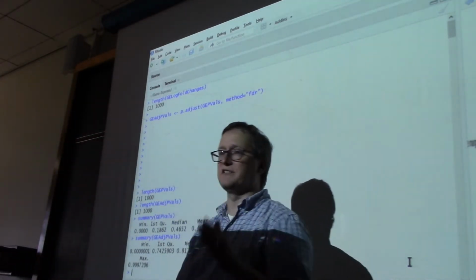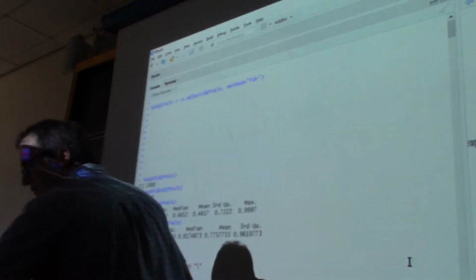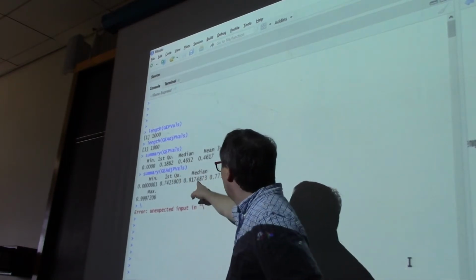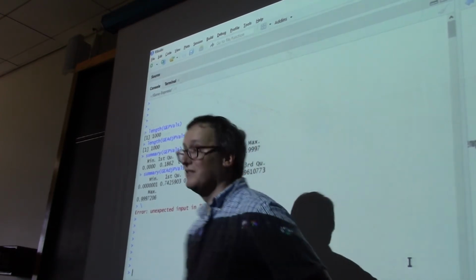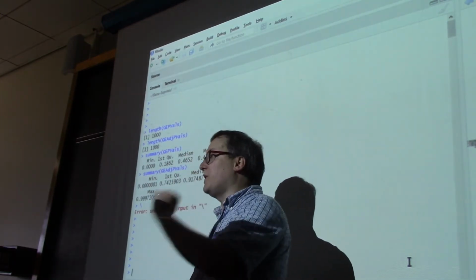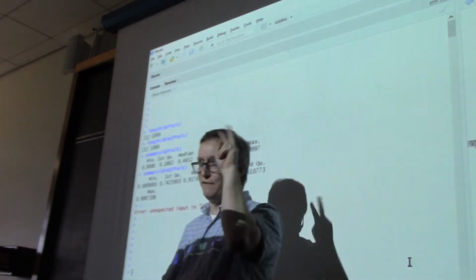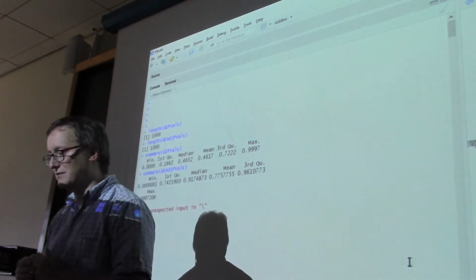Well, how about the middle of the list? If we sort all of those p-values, did the middle change? You can find that from the median. The median for the p-values before we did any adjustment was 0.465. After we did it, it jumped. Look at that, a huge jump to 0.917. So that's tremendous. This adjustment process has greatly reduced our chance of calling an individual test significant when it's not, a significant disruption from our null hypothesis.